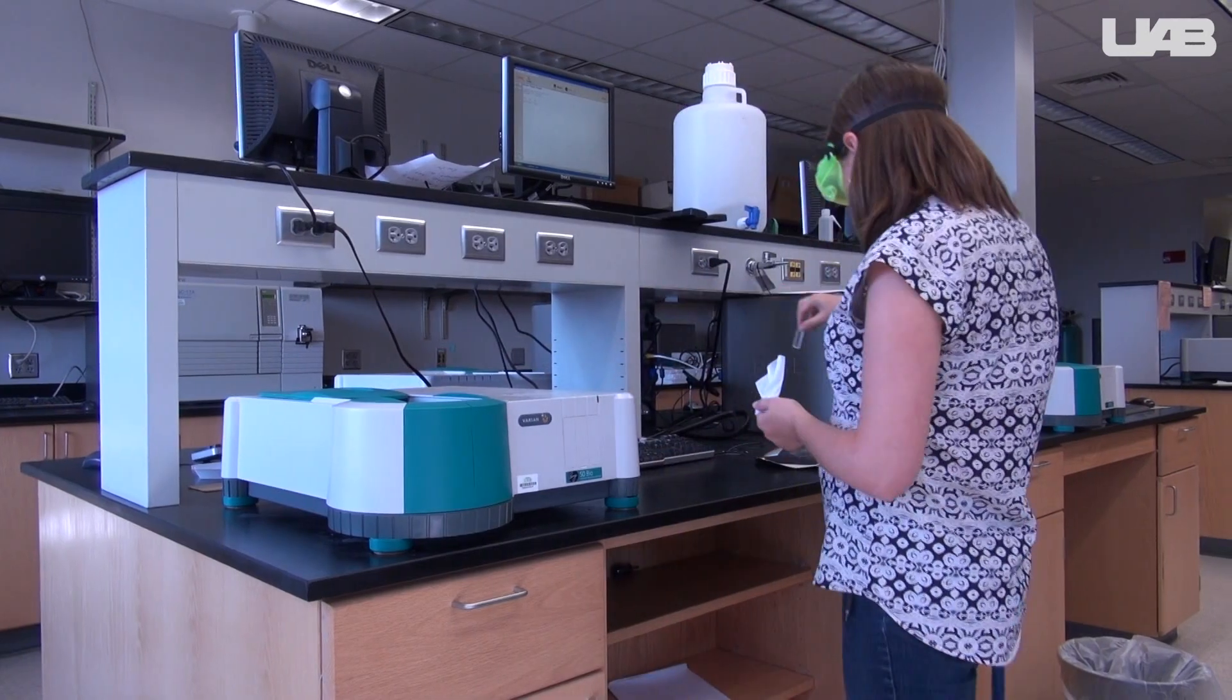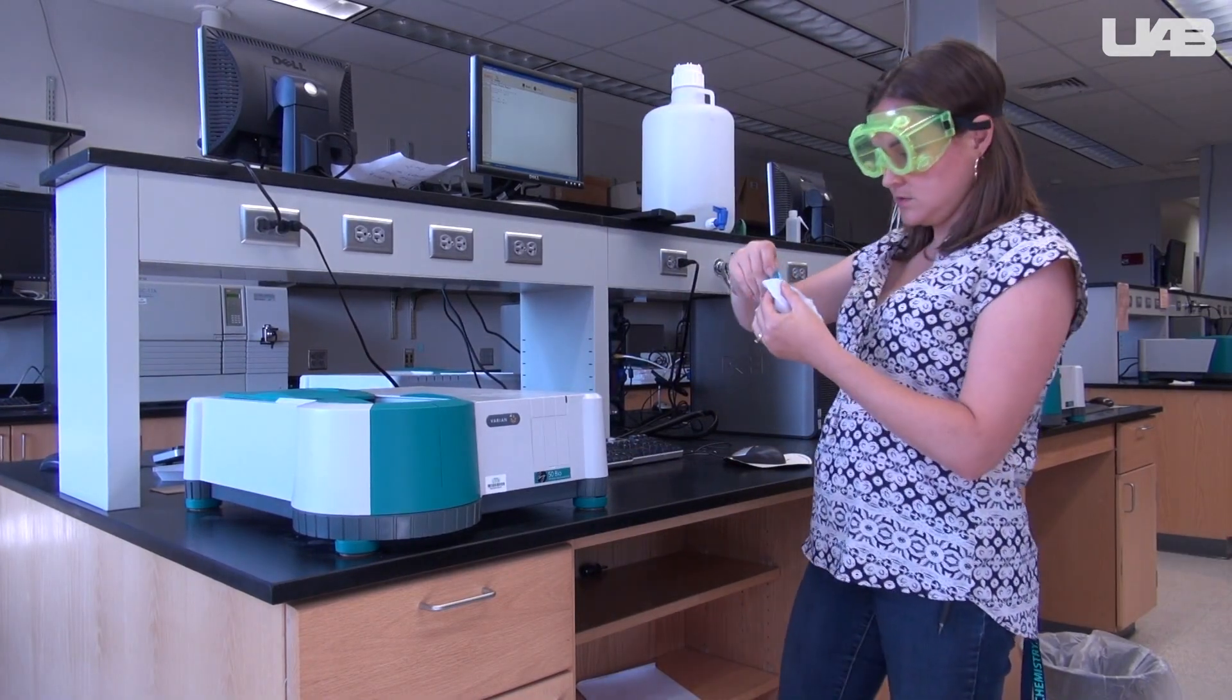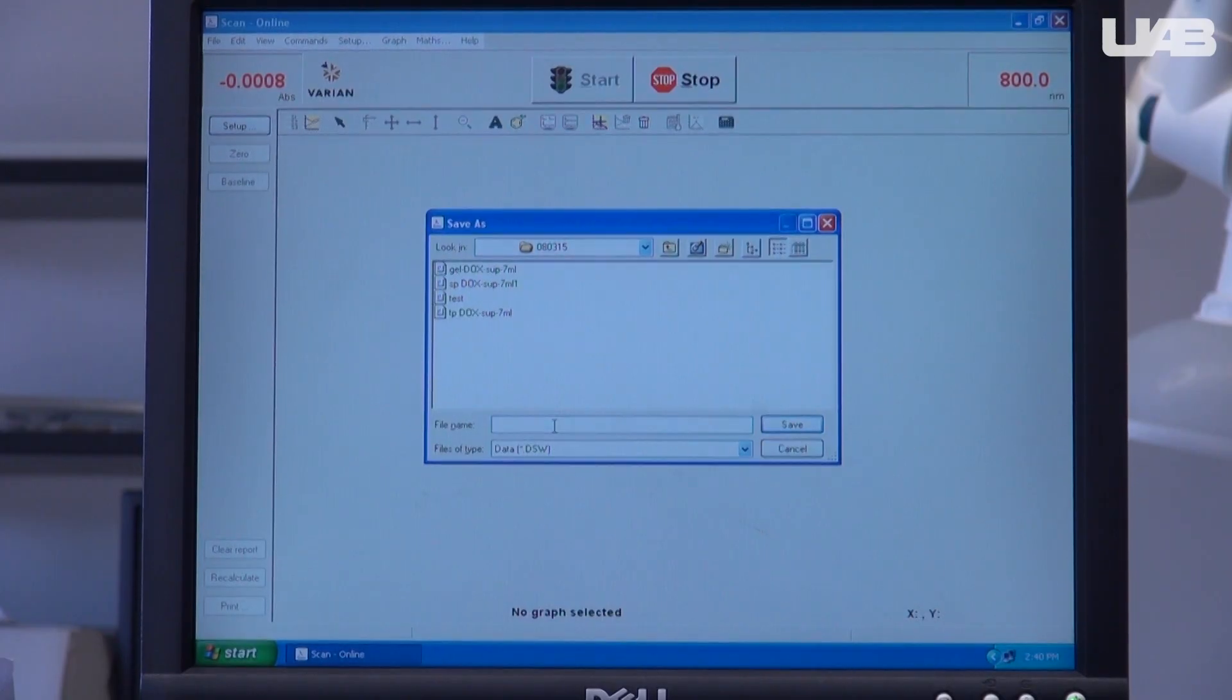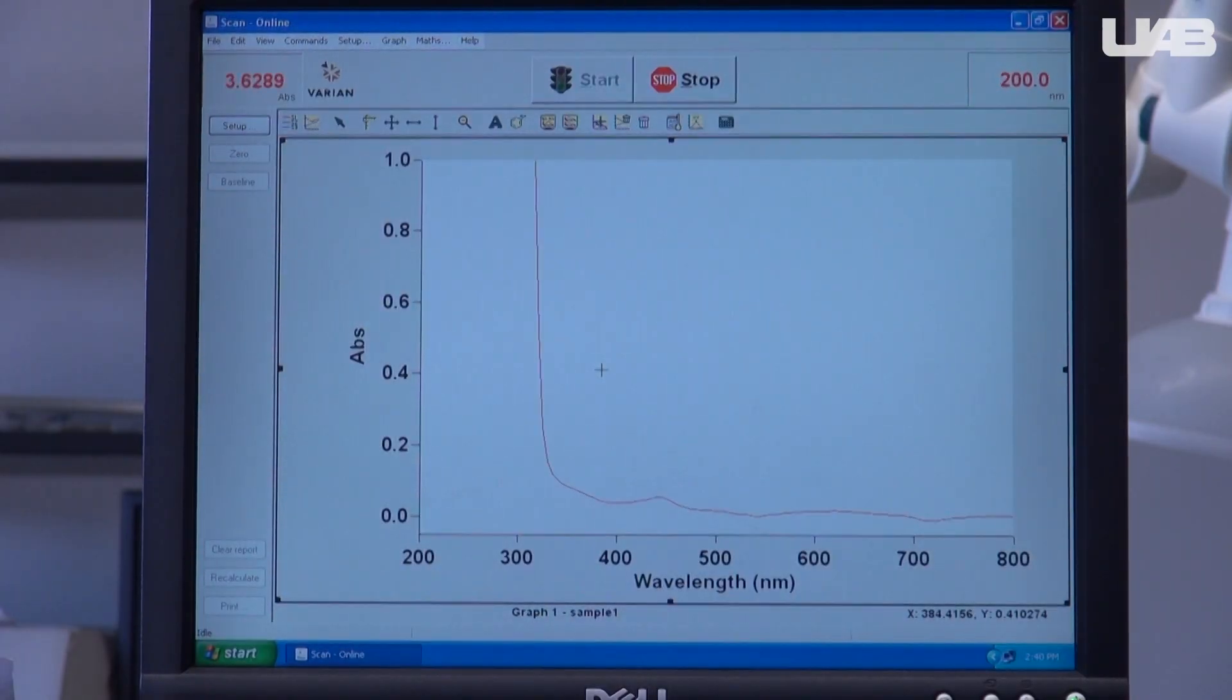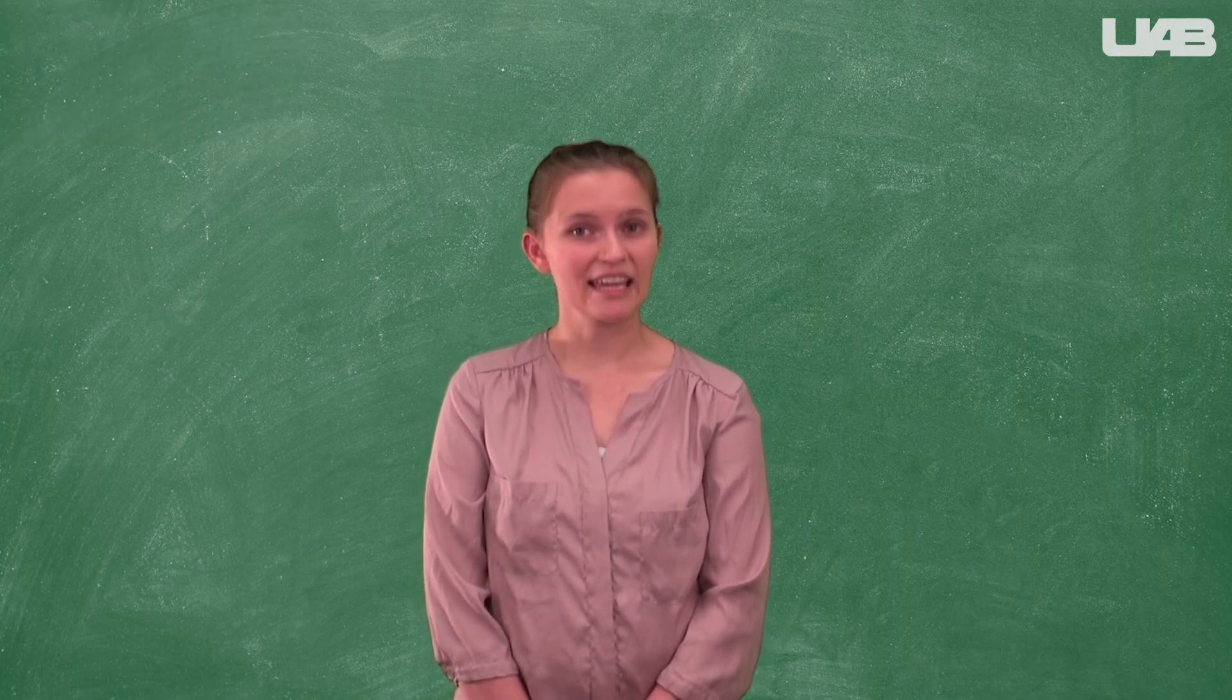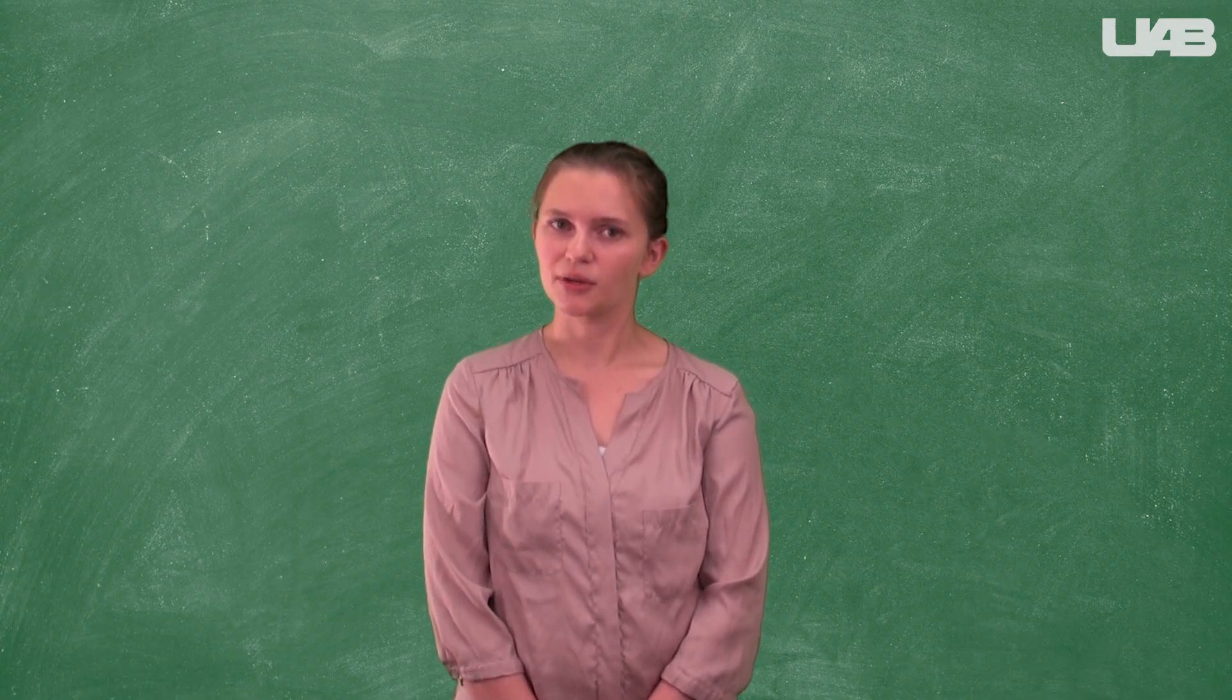Take out the blank, then pick one of your cuvettes with the colored solution in it. Clean two sides, the ones that the light will pass through, then place it in the spectrophotometer. Select start in the program, name your file and sample, then allow the spectrophotometer to collect data. Repeat this for each cuvette. You will compare the spectra that you measure with the spectra for each dye. These will be available in Canvas. Think about how you can use these results to determine how pure each of your components were.